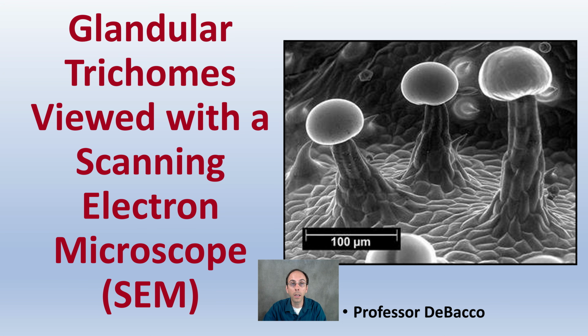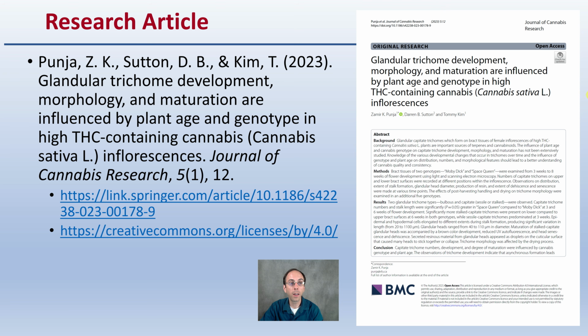I'm going to read some of the information so you can really focus on looking at the quality images provided here. Those quality images were provided based on this research article. If you want to take a look at some more of the details of the full study, you're welcome to use this citation to find it. But great images provided here, which I am encouraged to share with you.